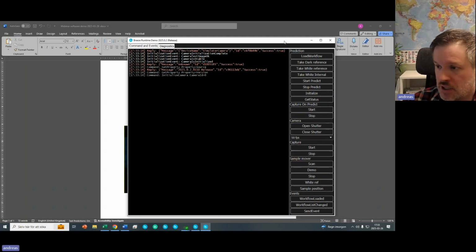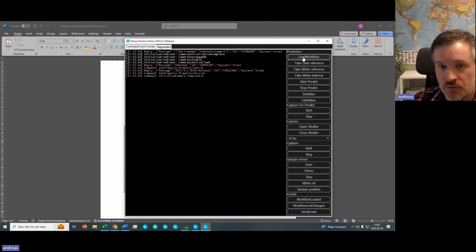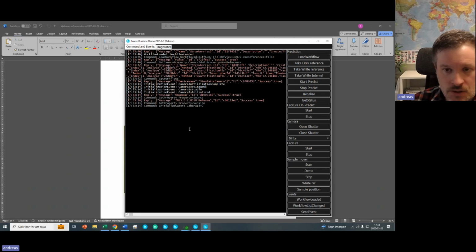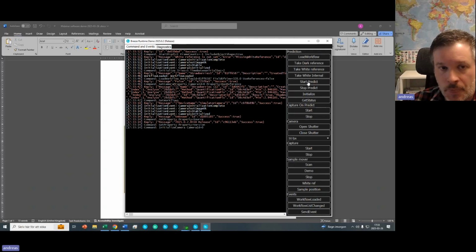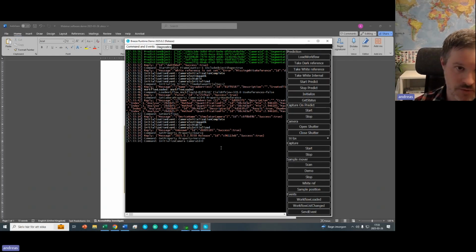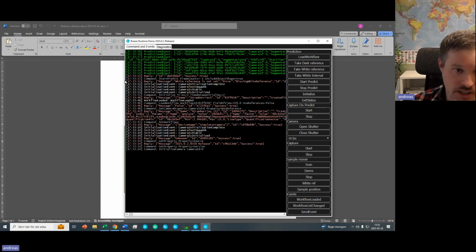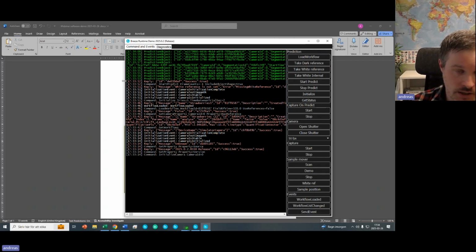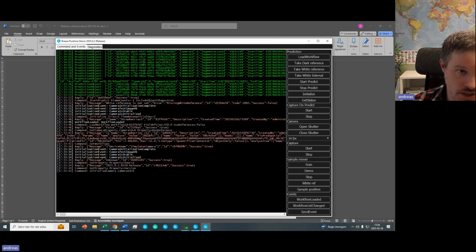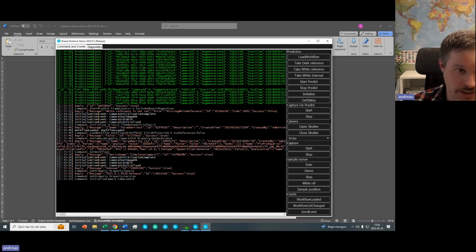So what we're going to do here is load a workflow. So I'll select the workflow we just made here. Okay. I will initialize this, and then I will start predicting. Now it will run this workflow that I showed you before. And you can now see the data being sent. So you can see the communication here from what's calculated.